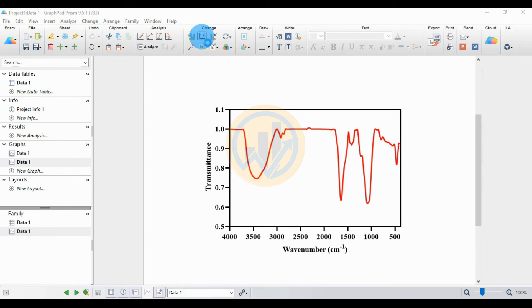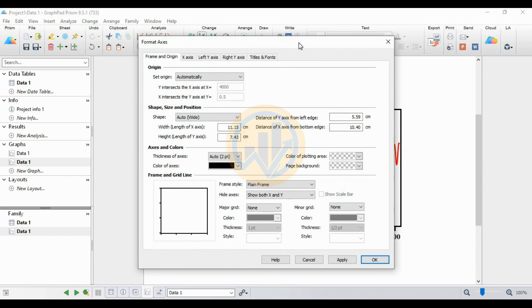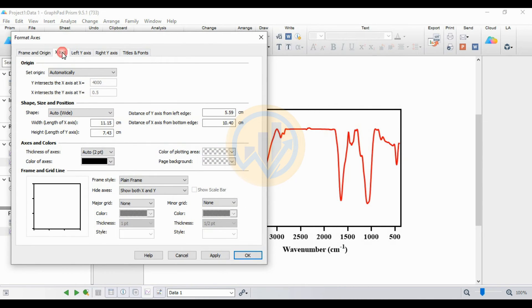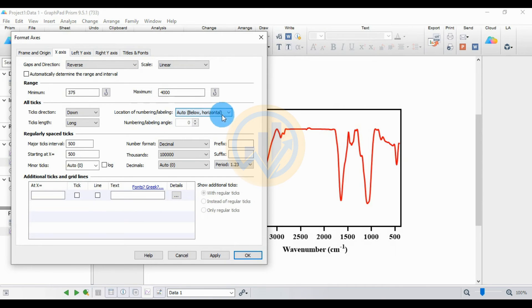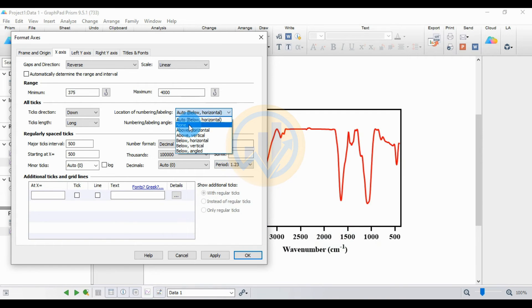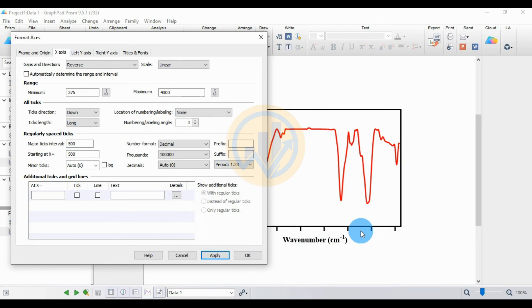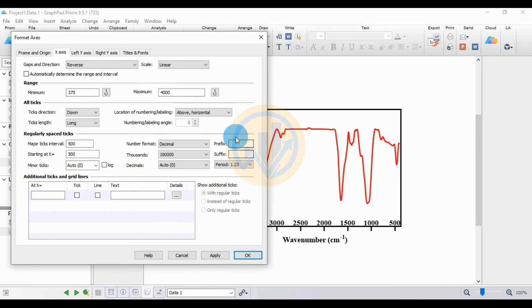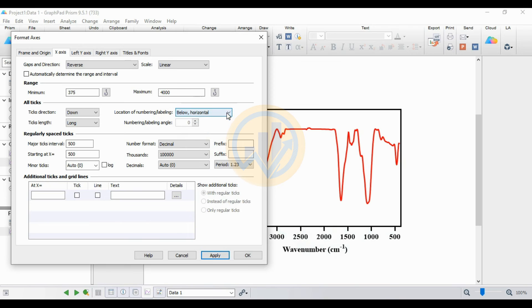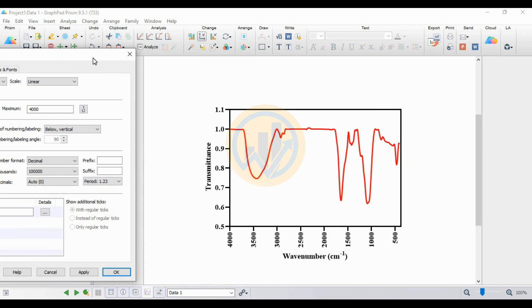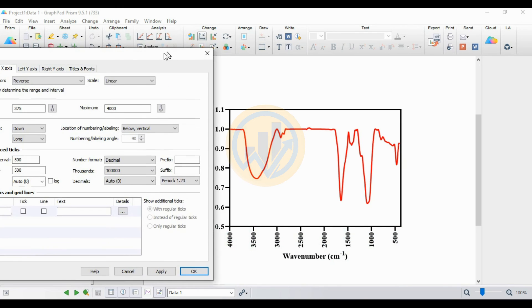Choose 'Format Text' and go to Axis Settings. For the location of the number label, the auto setting is 'Below Horizontal'. You can change it to 'None' to hide the values, or set it to 'Above Horizontal'. Set it to 'Below Horizontal' for auto. Then choose 'Below Vertical' for the vertical axis. The wave number X-axis range goes from minimum 500 to maximum 4000.